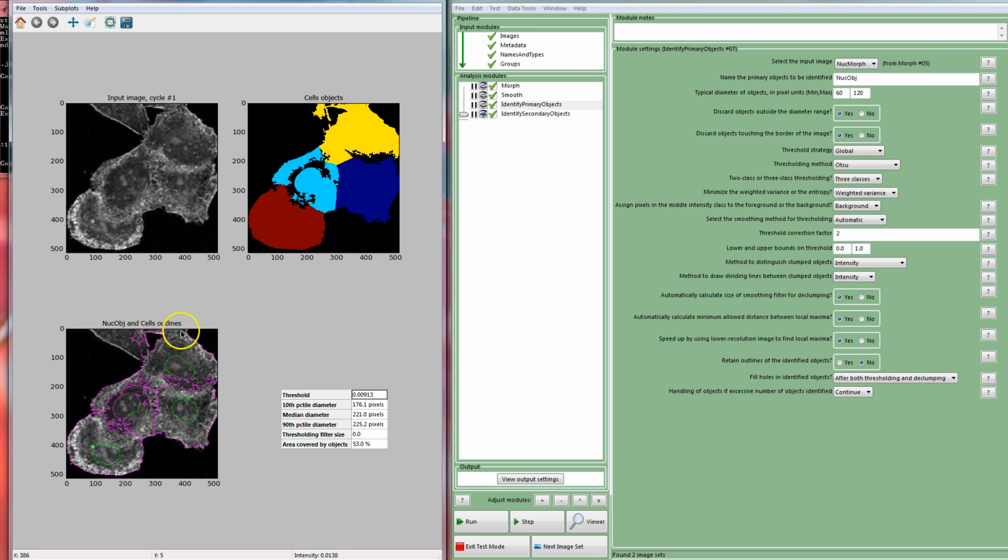This part, it turns out, is really hard to break up, and I'm going to try and see if I can find out some subtleties to take that away. But for now, we're going to find out all the cells, and then just pick these 3 at the bottom. And you can take the data to make the analysis easier.